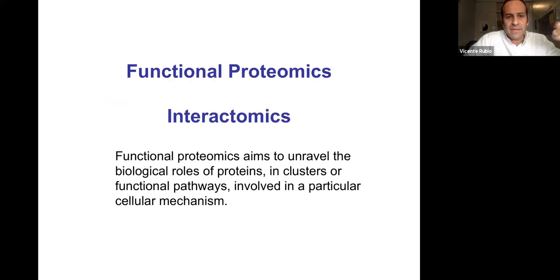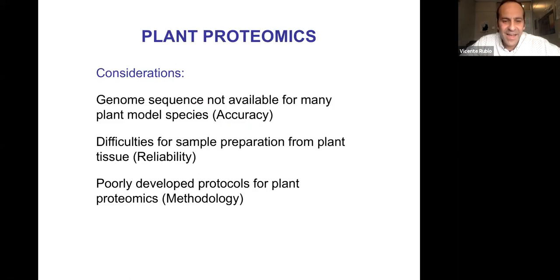For interactomics or functional proteomics, protein-protein interactions at the protein level, we want to unravel the biological roles of proteins in clusters or functional pathways involving particular cellular mechanisms. So these are all definitions that I will keep in the presentation.